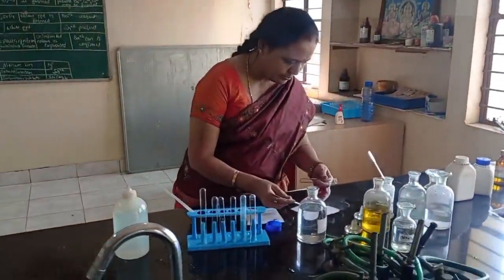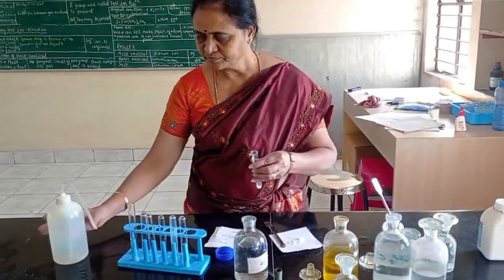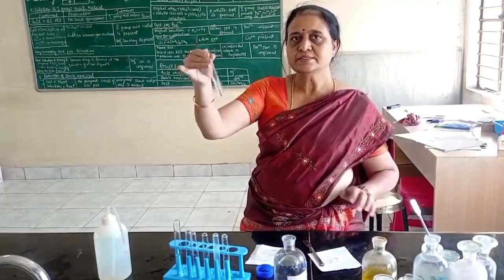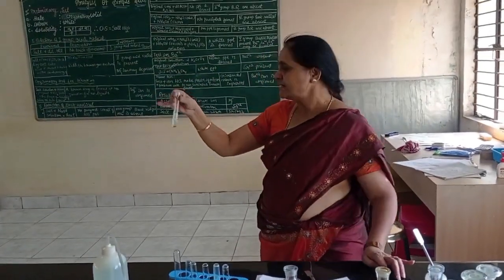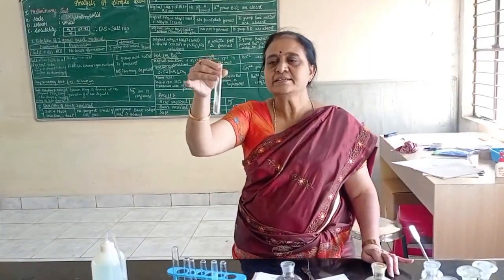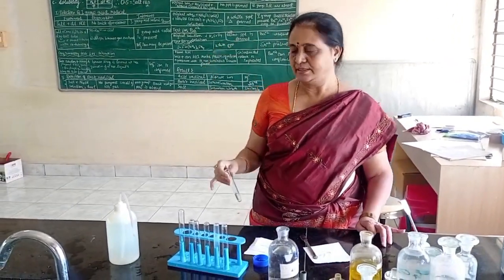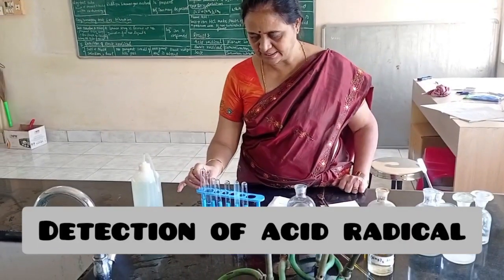Take a pinch of salt, add water, salted water. So original solution is salt plus water. Our salt is completely soluble in water. Solubility is in water. Now I am checking the detection of acid radical.